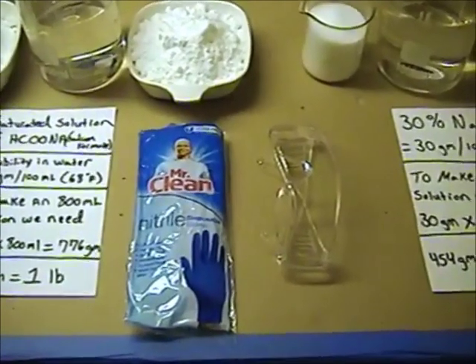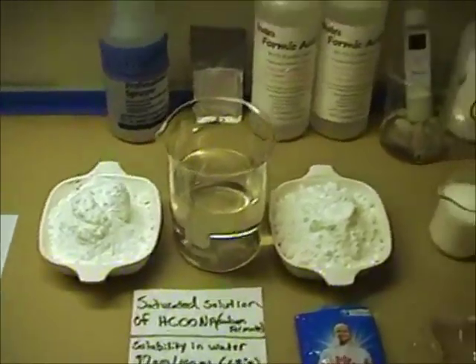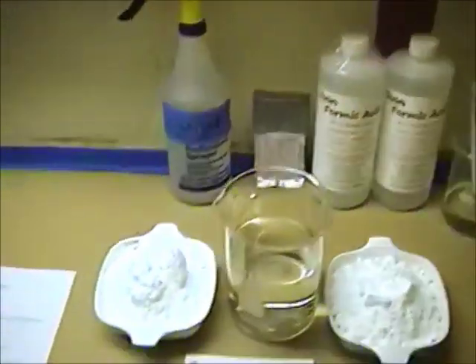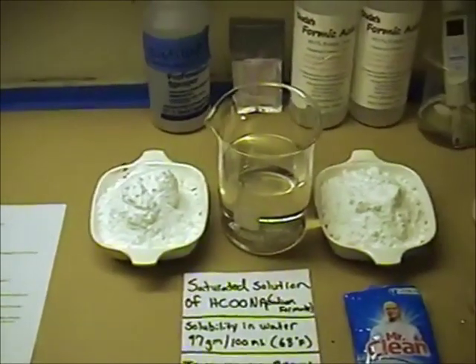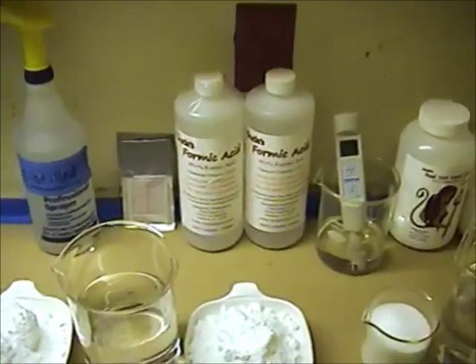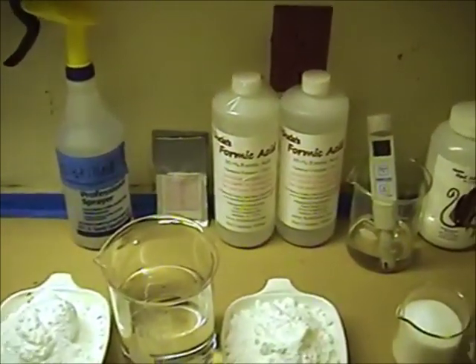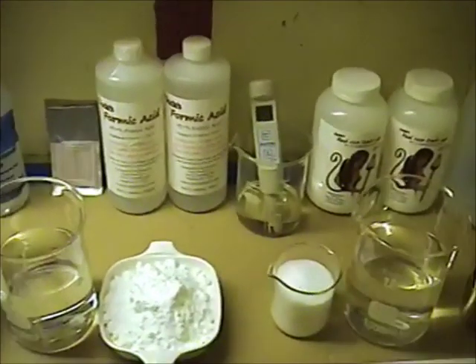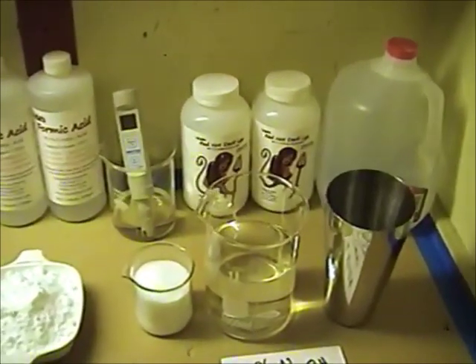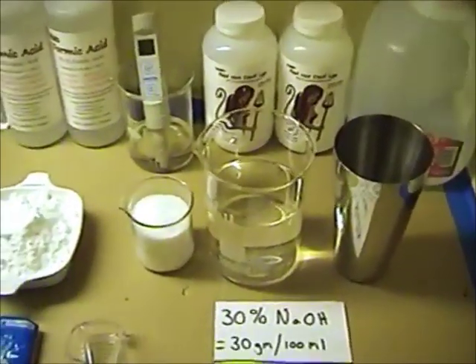nor am I going to work without eye protection. Now, it's not the sodium formate that I'm scared of. It's not the formic acid that I'm scared of. And you need to go read the MSDS on both of these products to understand the toxicology of them and the proper safety and handling precautions. Now, the thing that I'm scared of is sodium hydroxide.